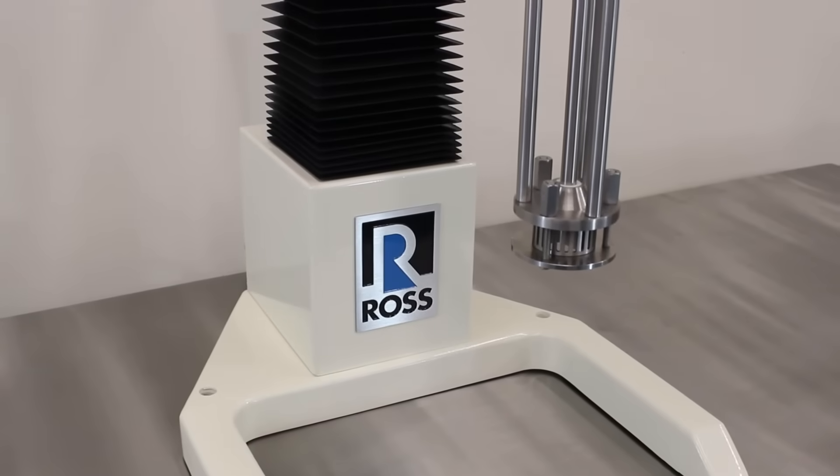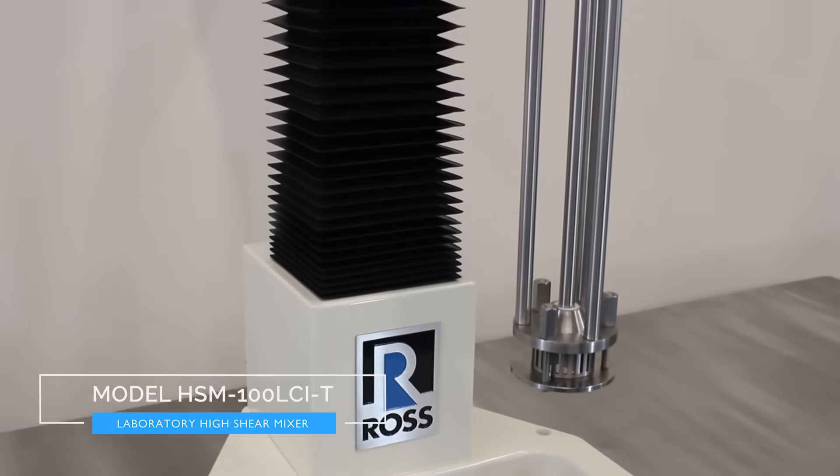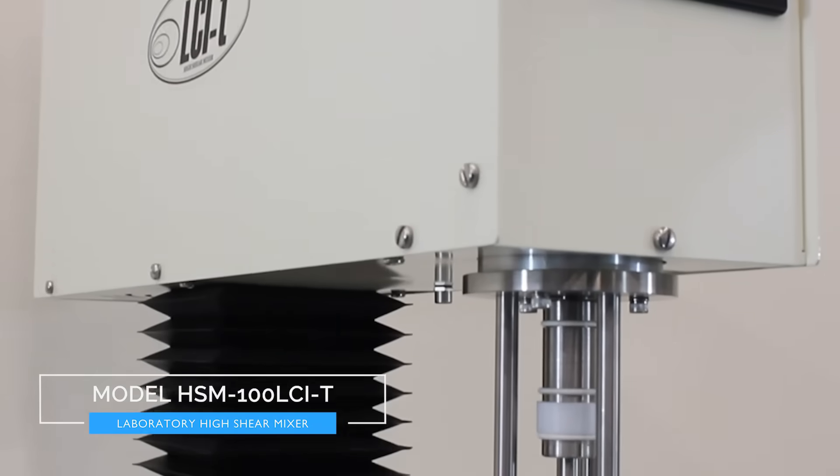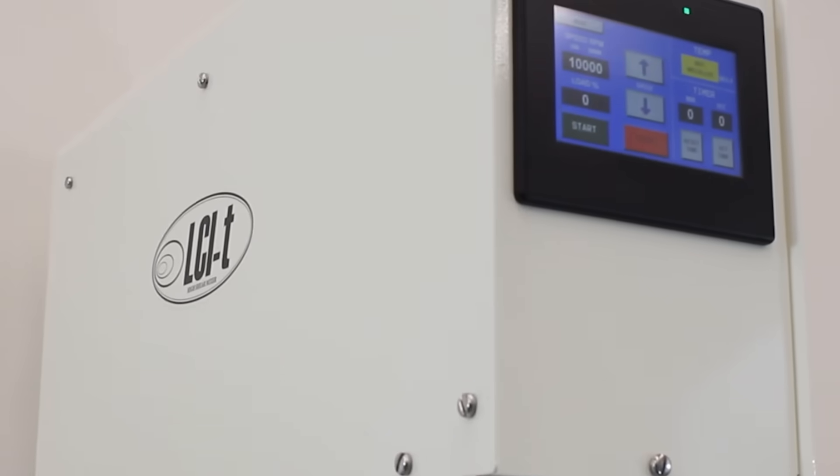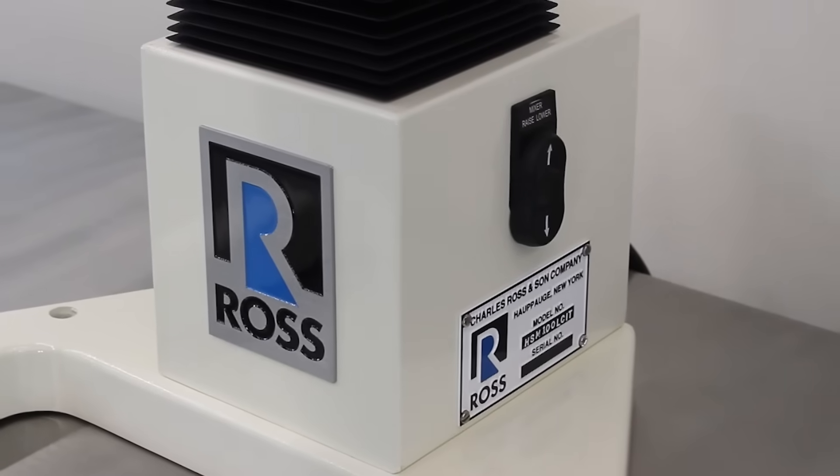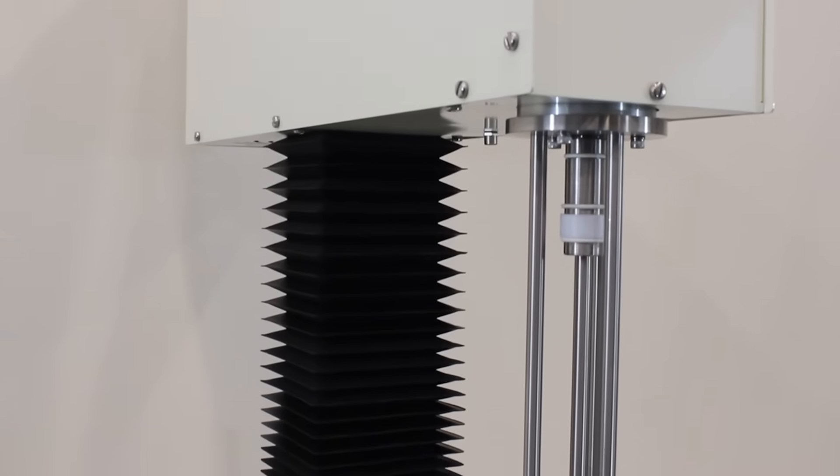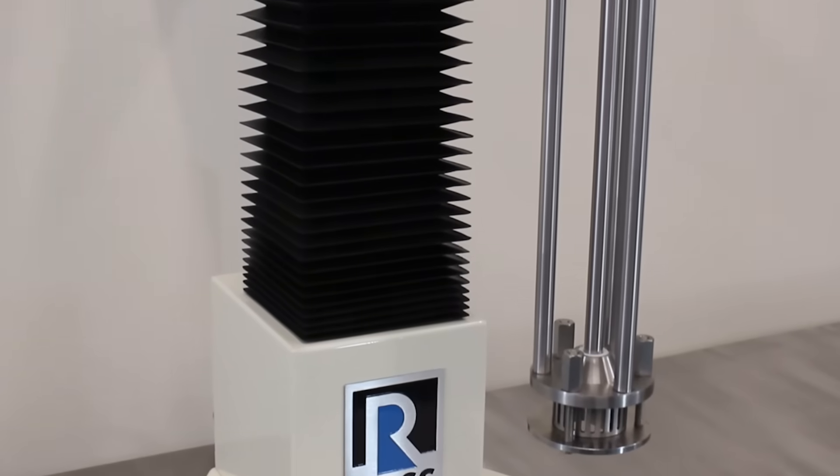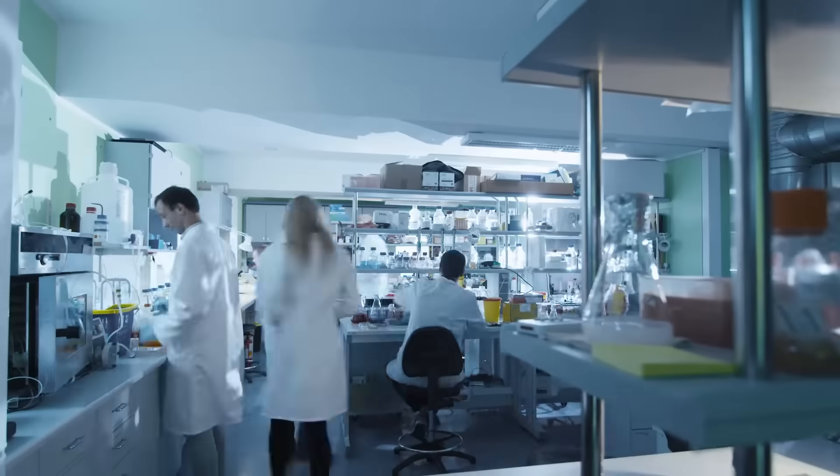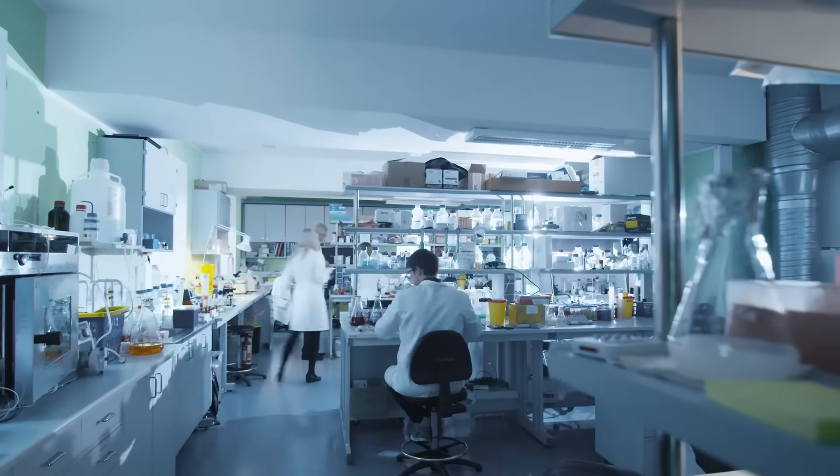The Ross Laboratory High Sheer Mixer Model HSM100LCI-T is the most powerful and popular benchtop mixing device available. Unmatched performance of one horsepower makes the Ross an industry standard for laboratories and universities everywhere.